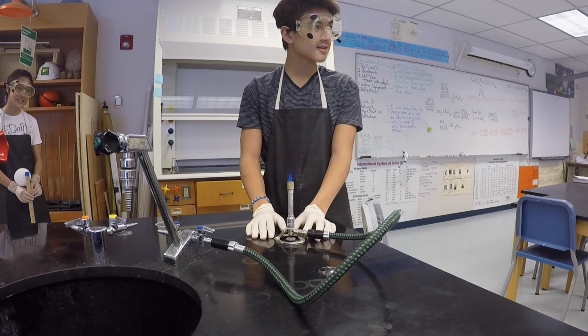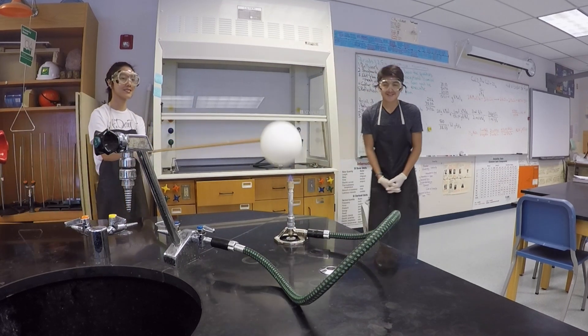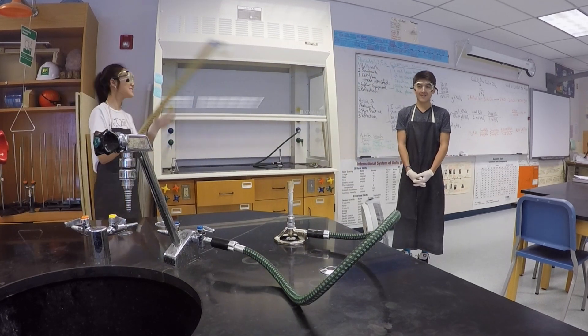Finally, light the Bunsen burner to a small but efficient flame, then place the balloon over the Bunsen burner. The balloon should pop for the end result.